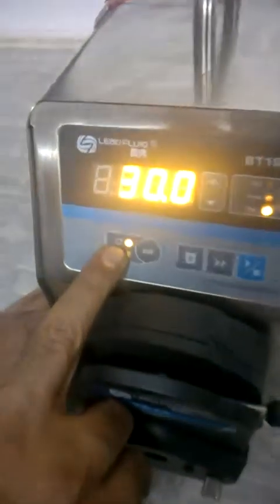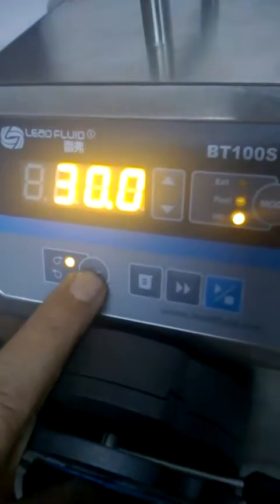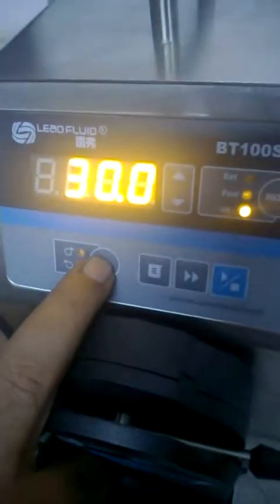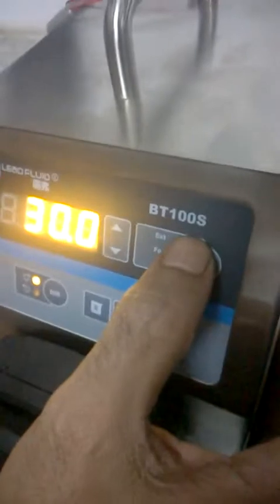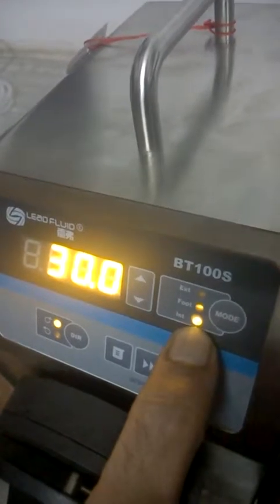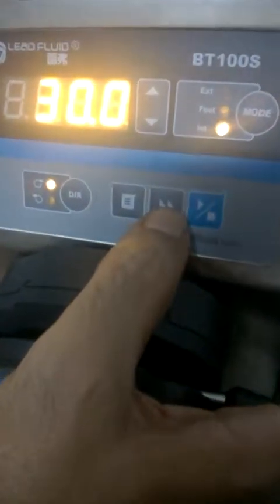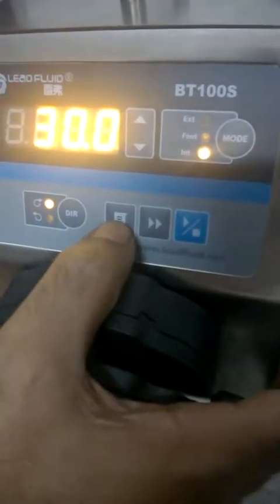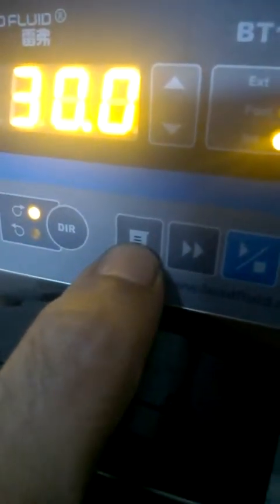If you want to run the pump clockwise the LED lights up, and pressing the direction switch reverses the flow. There are three control modes: external, if you want to control from an external source; foot switch mode; and internal mode. In the lab we run it at INT or internal mode. There are also three more function keys: one for flushing, a fast-forward key for flushing solvent, a run/stop key, and a special fill mode for dispensing a fixed amount of liquid into a vessel.